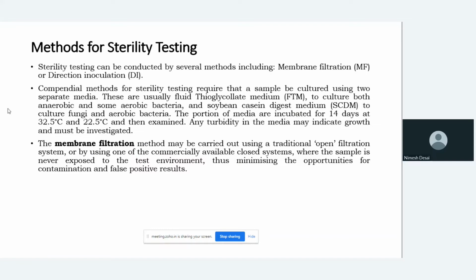Because sterility is a very crucial test for the patients. There are many microorganisms which are slow growers and may not be able to grow within a shorter period of time, like 5 to 7 days. So we give a prolonged incubation time of up to 14 days. If there is any slow-growing microorganism, we can easily identify it. That's why we incubate the canister or tubes up to 14 days in the case of sterility.